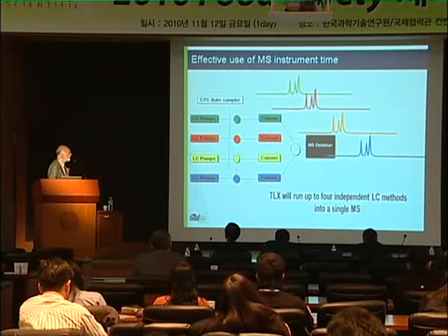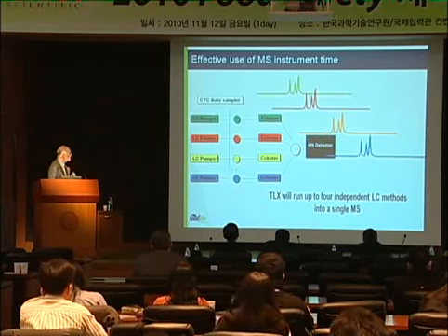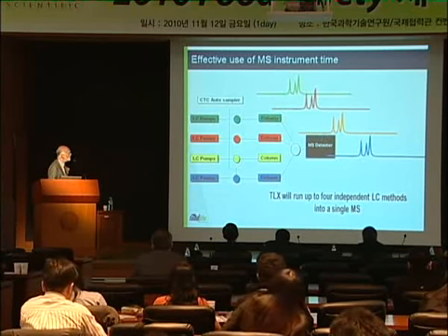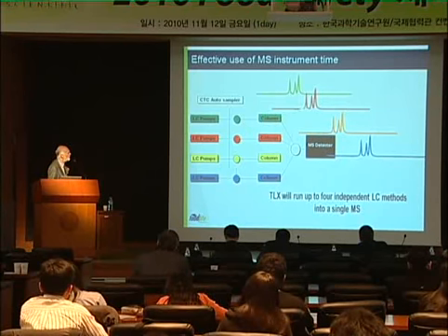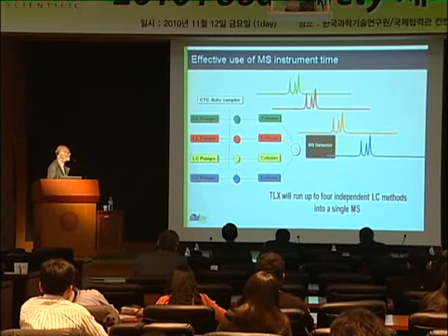Now, in this system, we're coupling 4 HPLCs to the same detector. So the first HPLC system elutes the peaks of interest into the mass spec detector. Immediately after the last peak is eluted, this column switches to waste. The next system then switches in, and we make measurements for this time window here. This then switches to waste. The third system comes into operation, and then the fourth system.